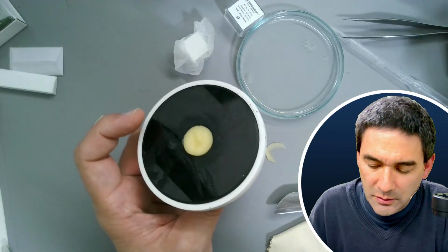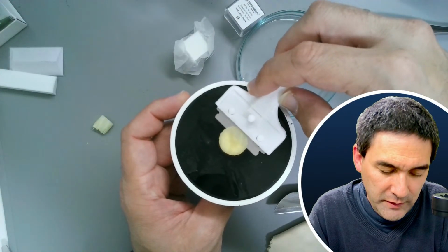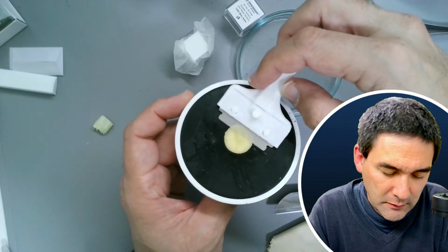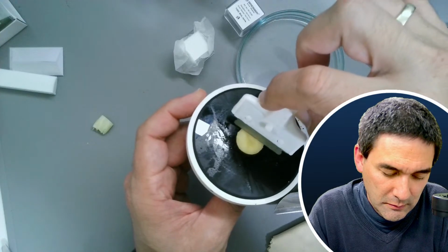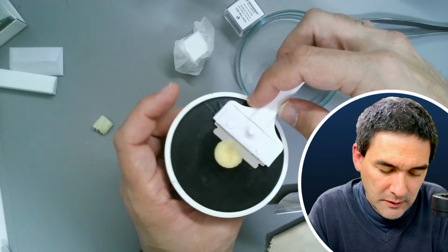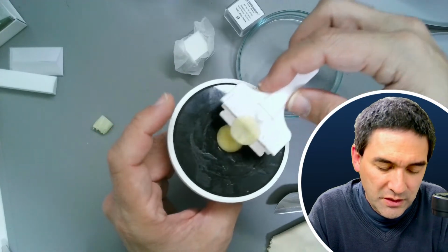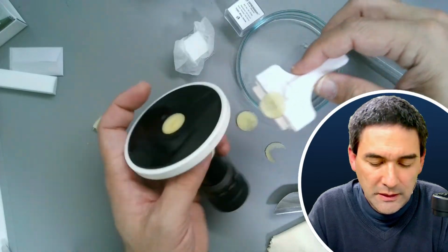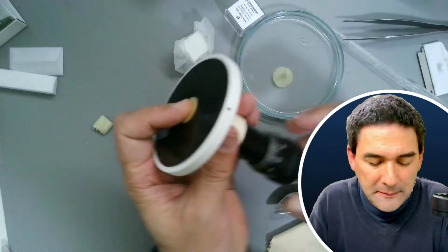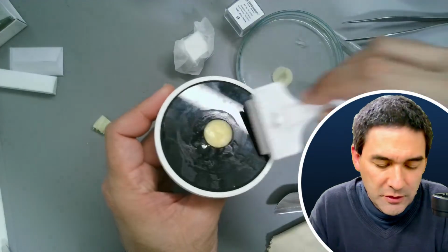Okay. Maybe if I just cut it a little bit like this here, very lightly, like this. Difficult. And because of this issue, I've never used this microtome very often. Again, I've got this one here, but I think it's still a little bit thick. So let's try it again.